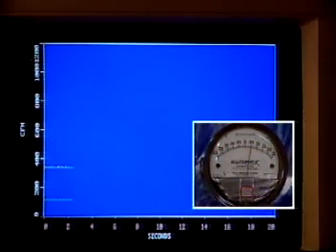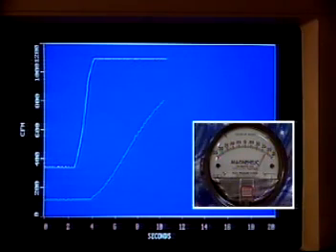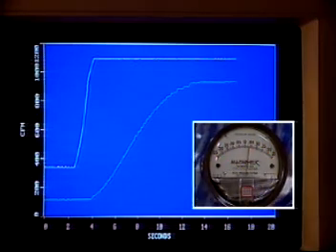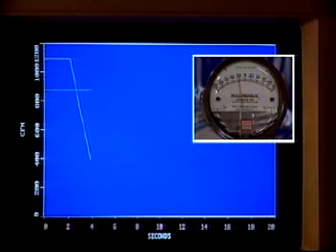Again, we have a graphical representation of the sash opening and closing. The white line is the total exhaust, and the green line is the total supply into the room. Notice that with a 6-second response delay, the lines cross, indicating a change of state from negative room pressure to positive room pressure.